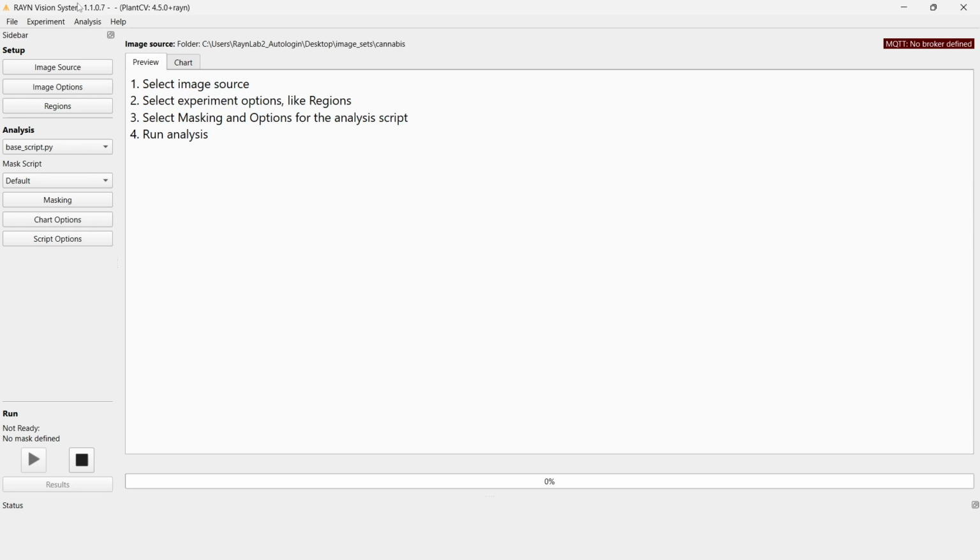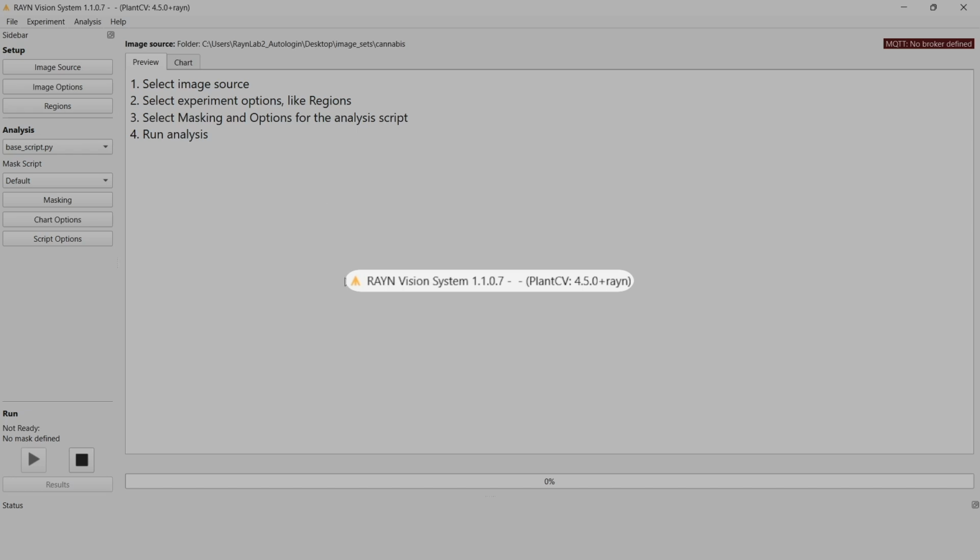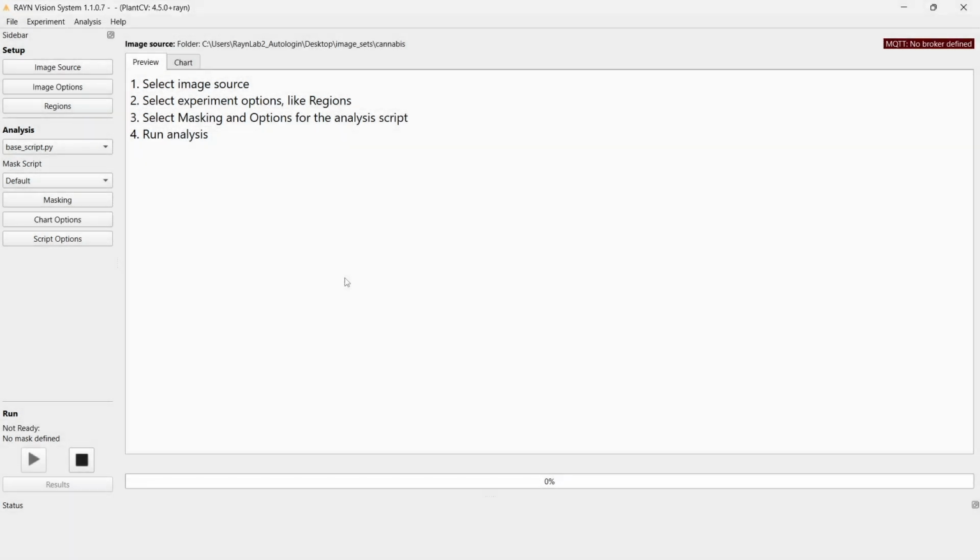Analytics. We are currently running version 1.1, build 7. If you have an older version, there might be a few features that are not available in your version, so please upgrade. But it's also possible that we already released a newer version. But I think you should be fine, and image analysis should not change in the future too much.